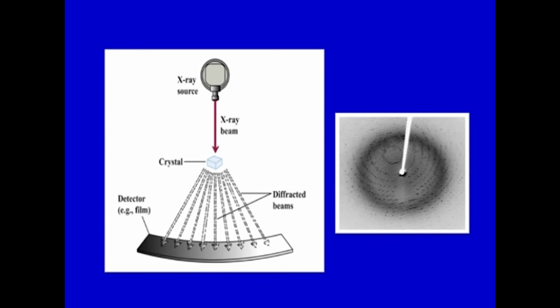So, if we summarize, there is an X-ray source, and the crystal mounted in a loop is irradiated. The crystal diffracts as per its packing and other parameters. Now, remember, as we have discussed in microscopy earlier, the higher the angle of diffraction, the more outer the diffraction is from the center axis. At the center it is not diffracted. So, as you go along this angle, the higher the angle, the more will be the resolution. This is a screen, or it could be a photographic X-ray film, or a phosphorescence screen as in an imaging plate scanner, or there could be CCD detectors and other detectors. And finally, what you get is the diffraction pattern.